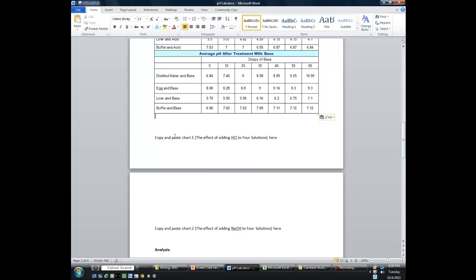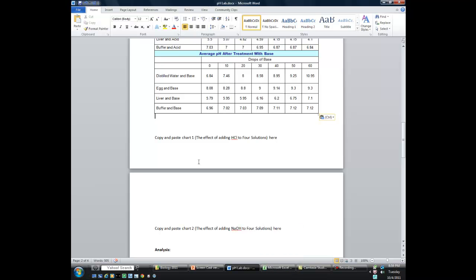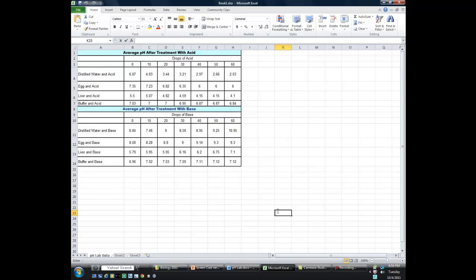The next thing you need to do in the data section is to complete chart one and copy and paste it in. Chart one is going to look at the effect of adding hydrochloric acid to the four solutions that we used. I'm going to give you a brief rundown on how to do that using Excel. You may be experienced using Excel and this may be simple for you — you can always customize it — but I'm going to show you the basic way your chart should look. By the way, in Excel, what we normally call a graph is referred to as a chart.